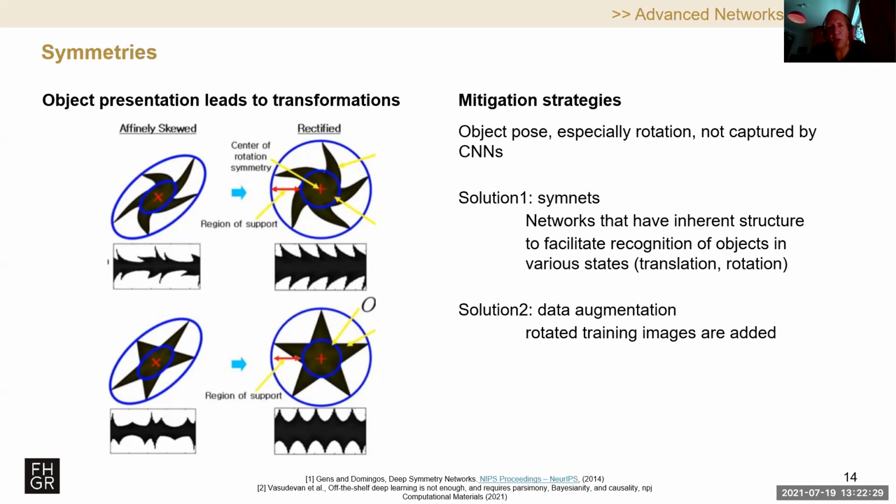There are of course mitigation strategies that we can use. We can use, for instance, neural networks that have been specifically designed to have these sorts of symmetries incorporated, so that it doesn't matter which way you introduce your image, it can be rotated, tilted, and you would still get the same result. Or what is more frequently used is data augmentation. So there is a rotation procedure when you train your data, and this automated rotation procedure is called data augmentation.